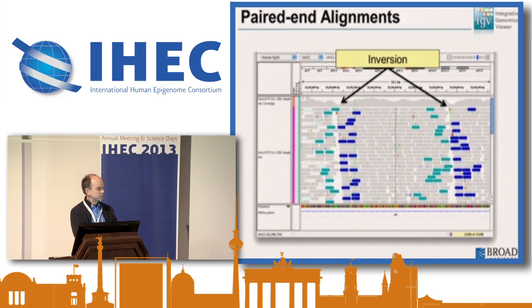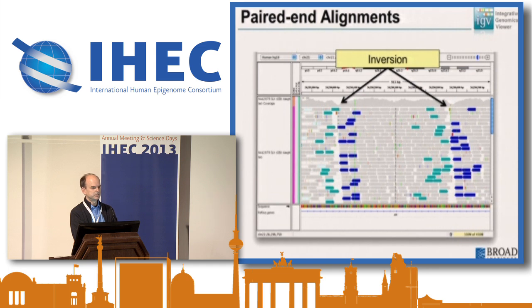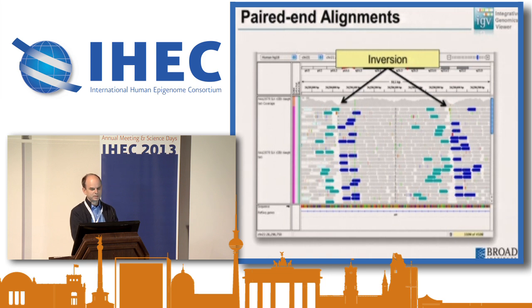SNPs and mutations are what most people use IGV for. It also understands paired-end alignments, expected orientations, expected insert sizes, and uses various colors to flag different events — this example is flagging an inversion. That would take a very long time to explain fully, so I'll ask you to take my word for it. This is from a Thousand Genomes sample.